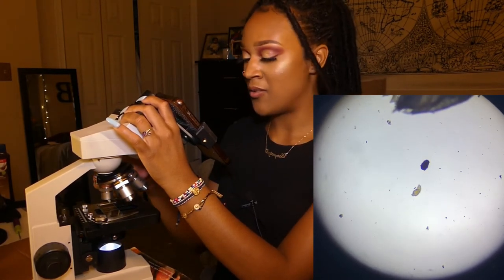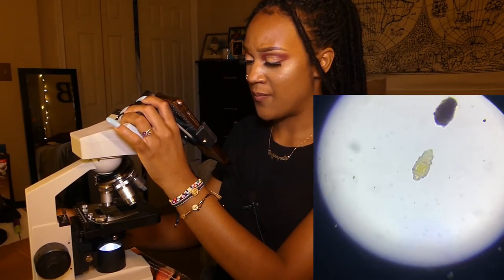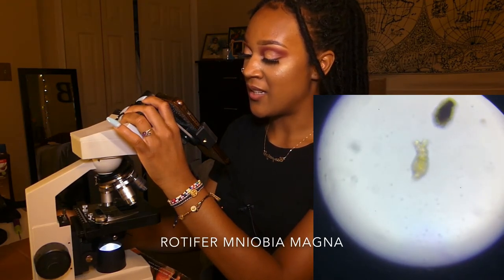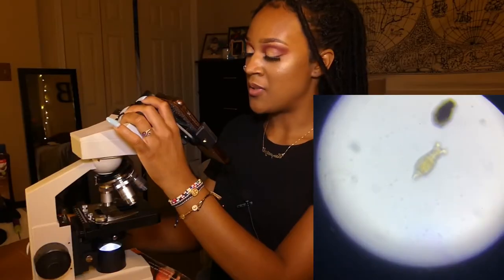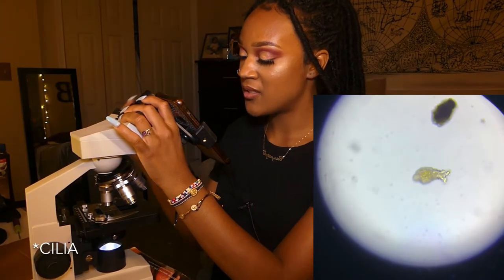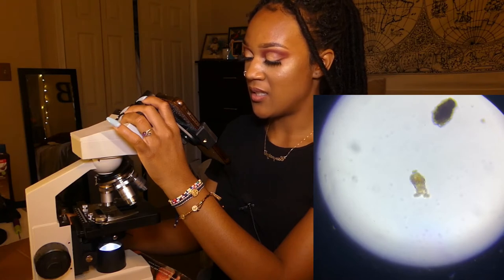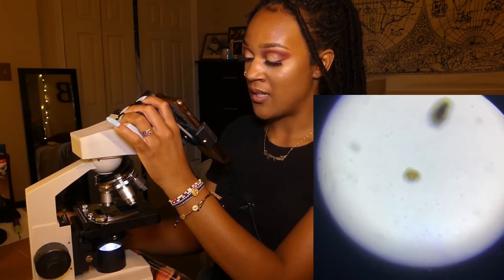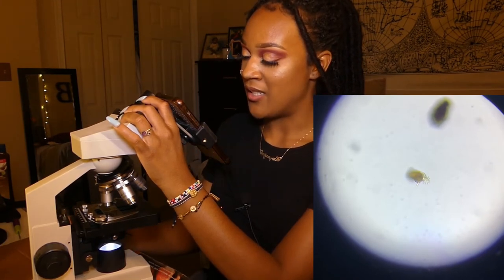I think this is also a rotifer, maybe. Let's get a closer look. Yes, look at this. Look at it filter feed. Look at those little, I don't know what to call those. Those are kind of like motors as it sucks in stuff to eat. Look at it. It's like towards me, like towards the cover slip, trying to eat.